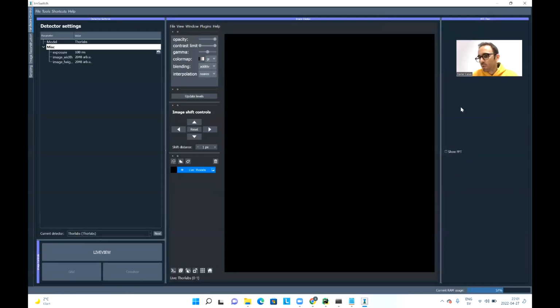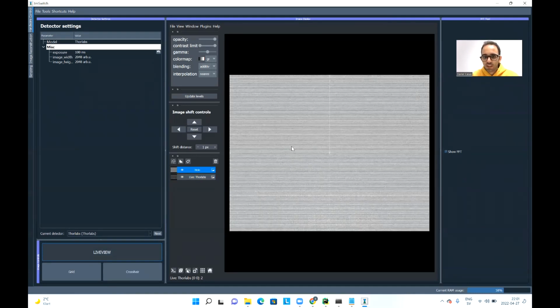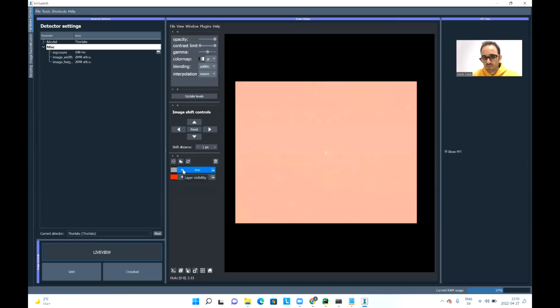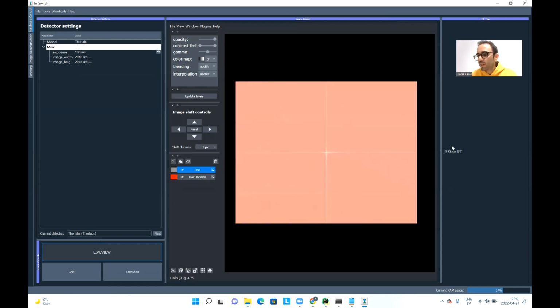So now our widget here is very simple. And when we click live view and click show FFT, we can see that there is a new layer in Napari, which is showing simultaneously the FFT at the same time as the live view. So here we can see. And this you can do with any type of processing, as long as you code it in the widget and then you do it with this type of architecture, then it will be included in this layer.